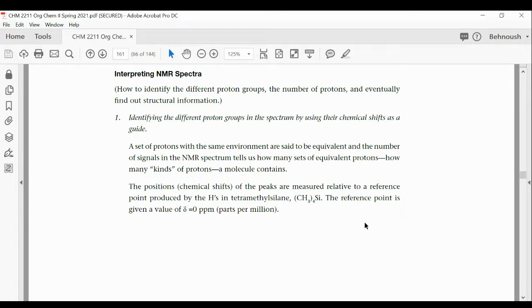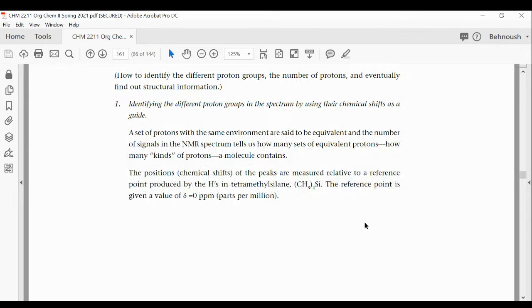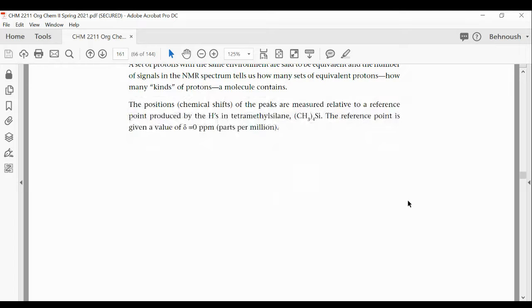NMR. I don't know if NMR has been covered or not in lecture, but for the NMR, we are only using some of the points of the NMR that pertain to a reaction. Let's say if we take the NMR of the product that is alcohol, we are looking for a short, broad peak anywhere between 1 to 7. The scale for NMR is different. It goes from 0 to 10.